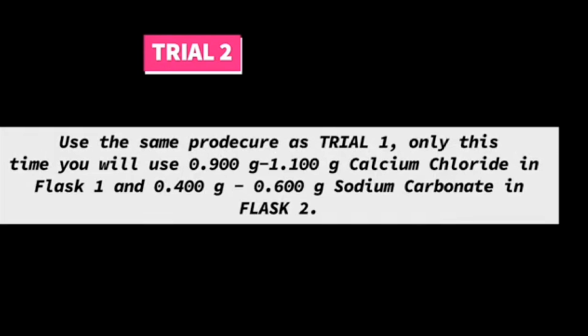Now you have to do trial 2. You're going to use the same procedure as trial 1. And this time you're going to be using 2 different amounts of calcium chloride and sodium carbonate.